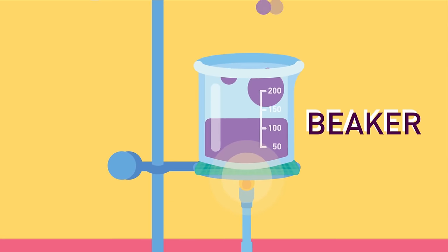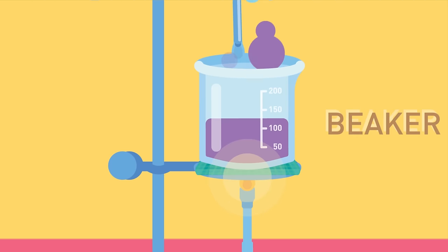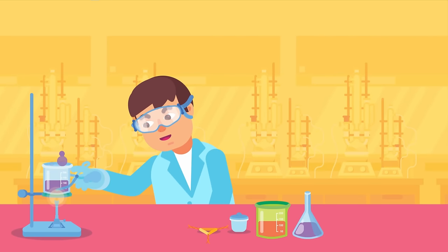Beaker. A beaker is glass apparatus, used to hold, mix and heat liquids. Beaker Tongs. Metallic, and looks like a scissors older sibling. Beaker tongs is used to handle beakers.